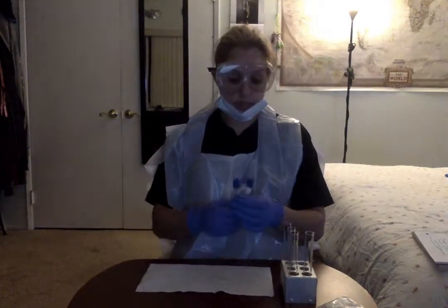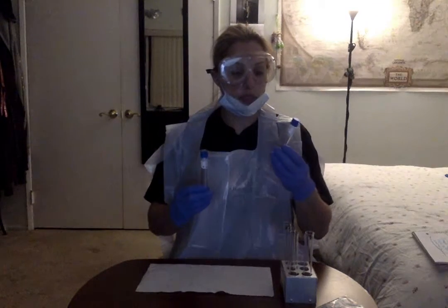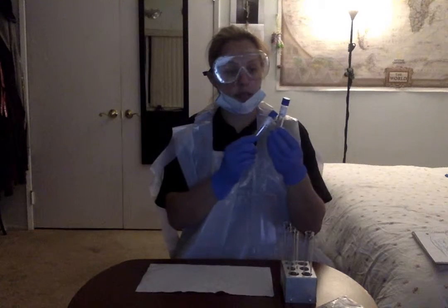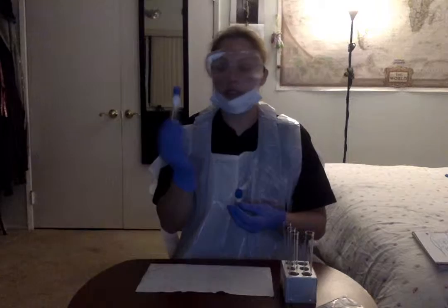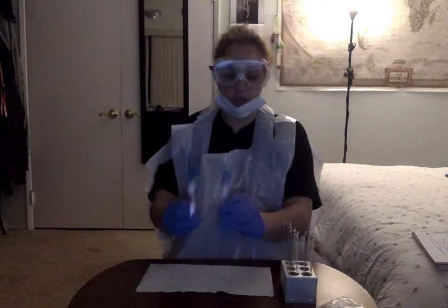With the first part of the lab, we have some existing cultured broths of E. coli and S. epidermidis. We took a few droplets of those and applied them to these two tubes here. This is the MRVP broth, and this one's labeled S. epidermidis. This is also MRVP broth. This is E. coli. Once we applied the S. epidermidis and the E. coli cultures to these broths, we let them incubate for a little bit.